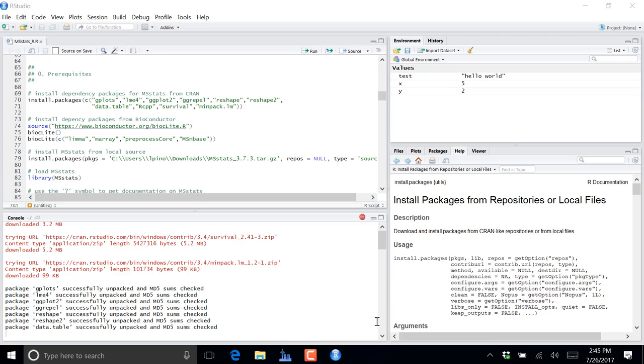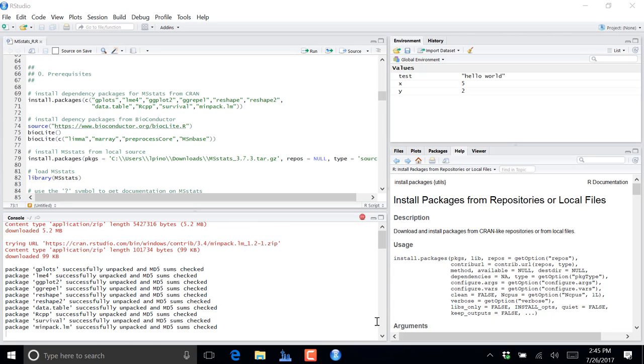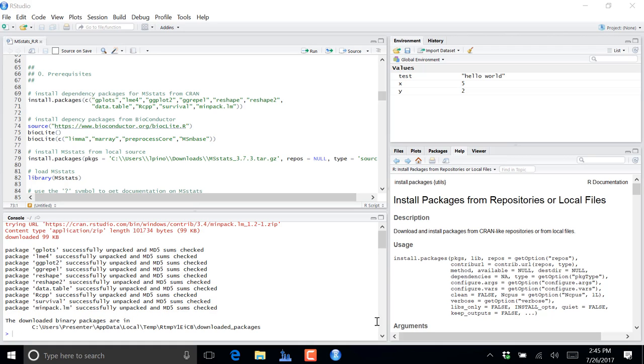It's still running a bunch of code. So we've got that stop sign there saying, I'm still going, I'm still going. If you want to kill what I'm doing, you can press the stop sign, but I would discourage you right now from pressing the stop sign. So we know we're done running that line 70 of code because we get our little input caret down here back. Our stop sign went away. We're ready for the next line.